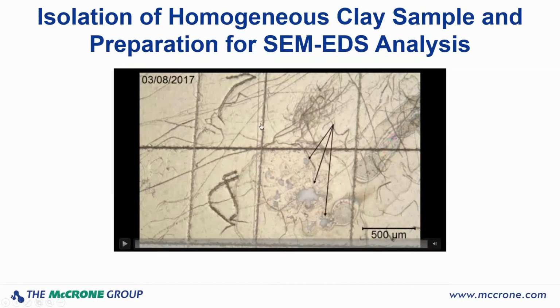So here we have our beryllium stub. Remember, these are about 1 millimeter by 1 millimeter square. So our samples are 150 micrometers in size. And you're looking at it with oblique illumination so that your sample looks white. Start the video.